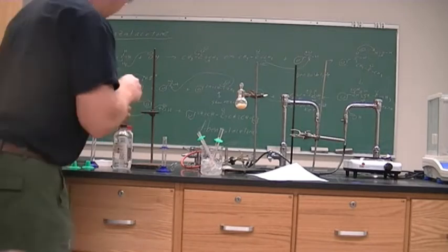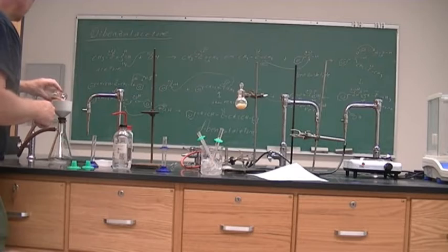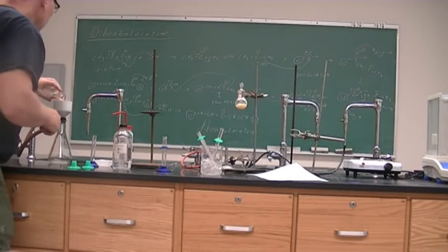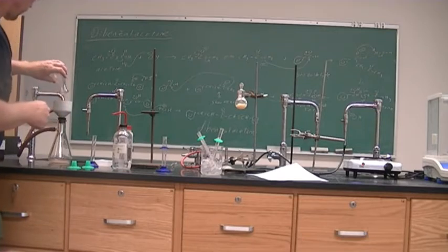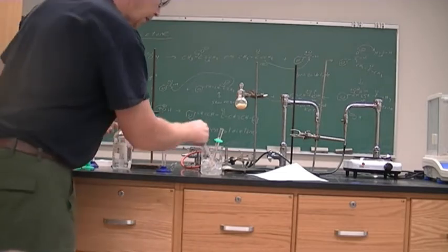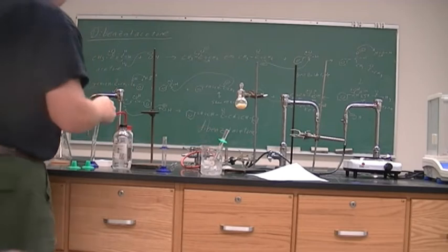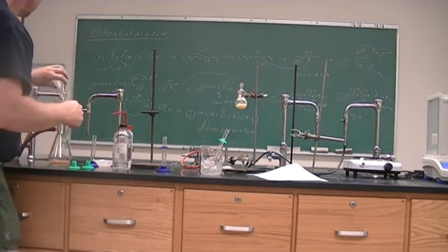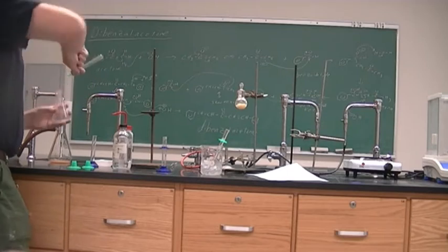Alright, so we're going to go with it. Alright, so I'm going to wash it out with a little bit of water.